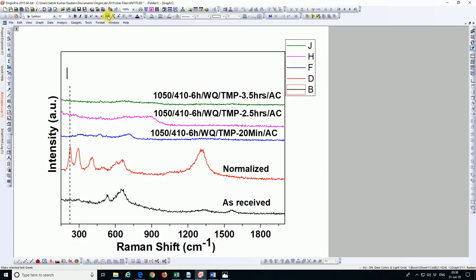If you want to write beta, you can click B, and it will write beta. So I want to write alpha, so I will click A from the keyboard. It has written alpha. Click one more time, otherwise it will continue to write Greek letters.